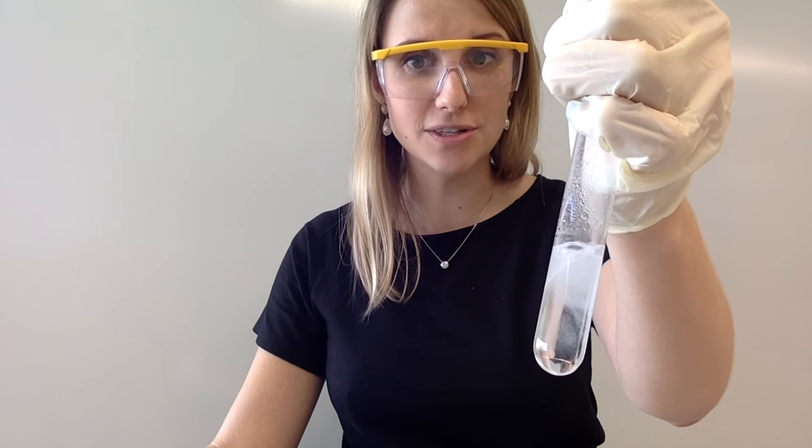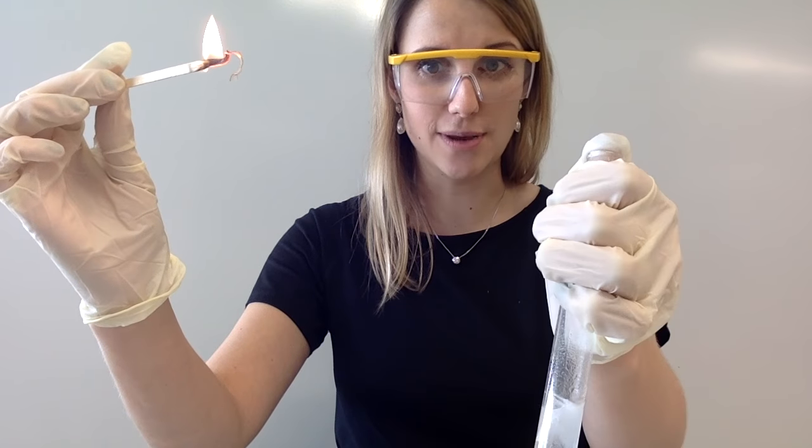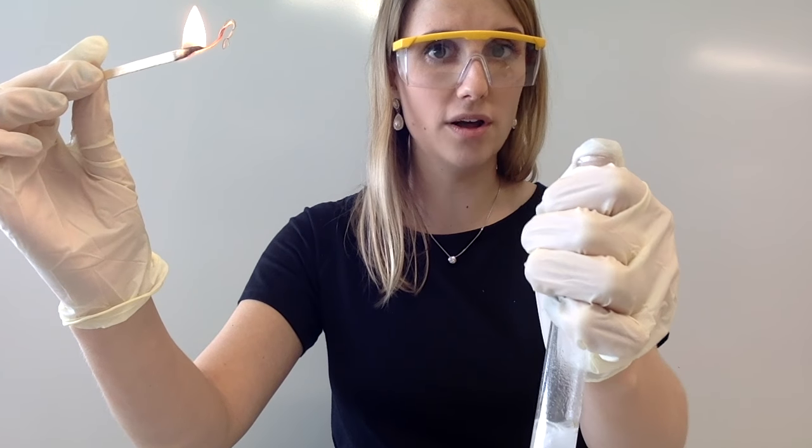So what I can do to prove that's hydrogen gas is I can put a lit splint into it. So listen for what sound you hear.